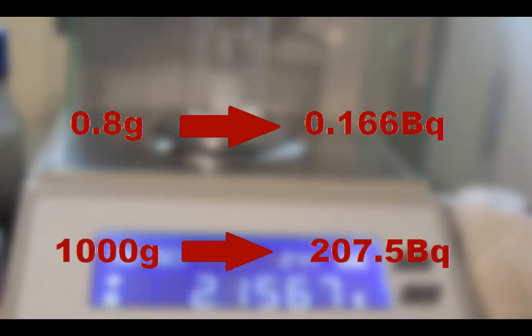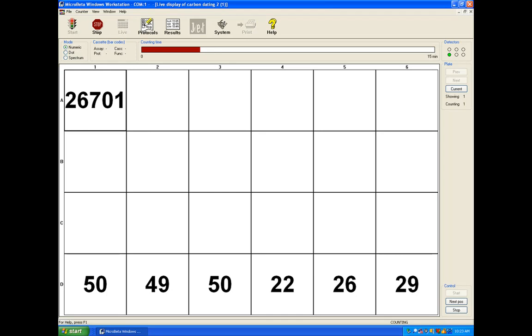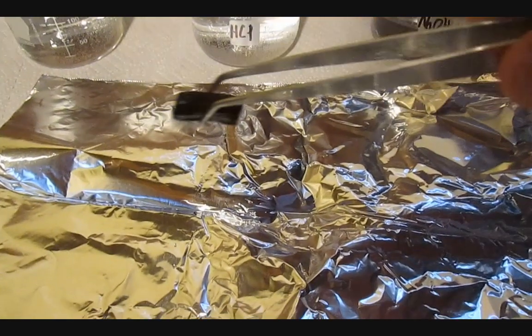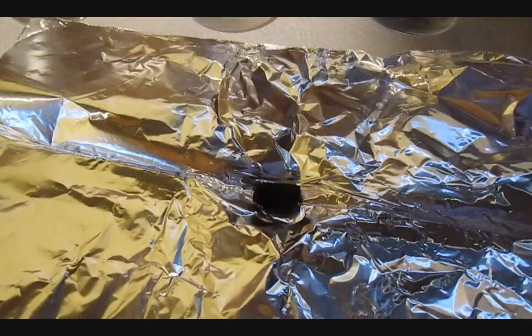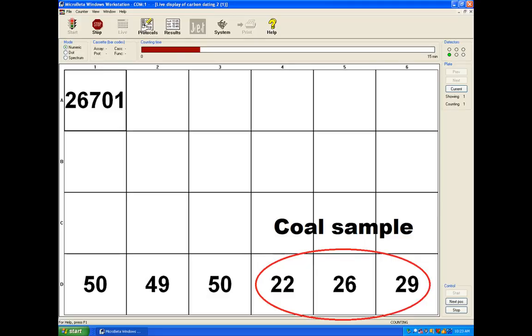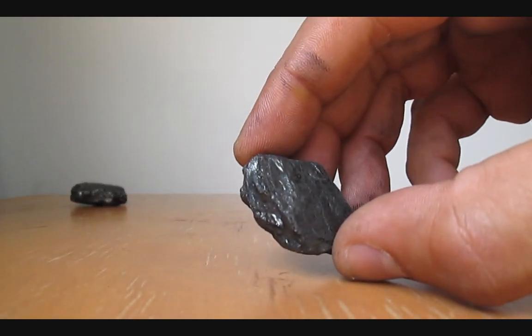Since I only used 0.8 grams of carbon, a whole kilogram would have given 208 decays per second, which is what is commonly reported, and matches the earlier figure of 230 Bq for modern carbon. Measuring the coal happened in a different matrix under less favorable conditions, so the background is about 20. And as predicted, coal is barely above that, mainly due to some trace contamination from modern carbon.